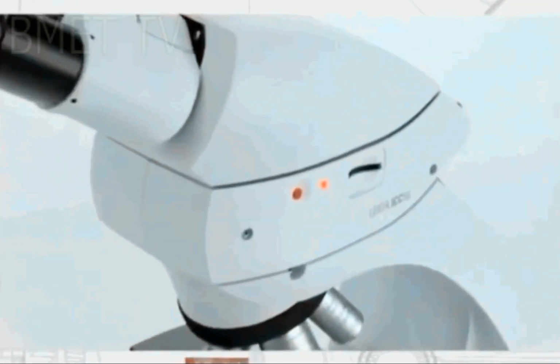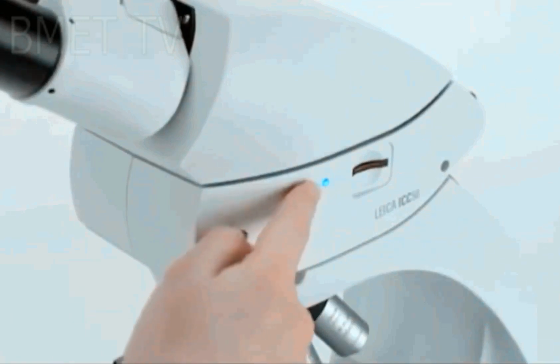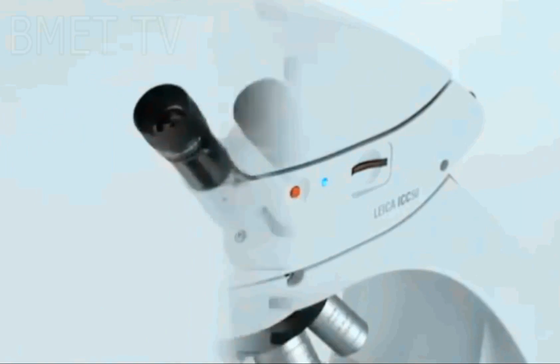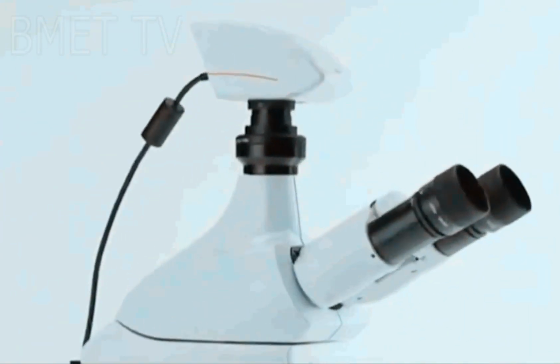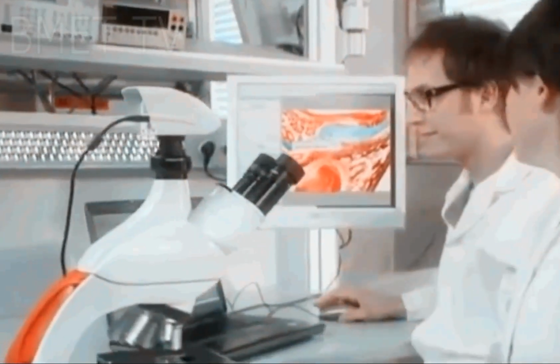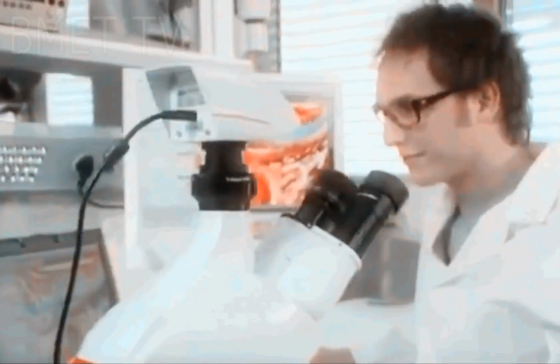The next type of microscope is the USB computer microscope. Although not well suited to the same scientific applications as other light microscopes, the USB computer microscope, among the different types of microscopes, can be used on almost any object and requires no preparation of the specimen. It is essentially a macro lens used to examine images on a computer screen plugged into its USB port. However, the magnification is restricted and is not comparable to your standard compound light microscope at only up to 200 times with a relatively small depth of field.